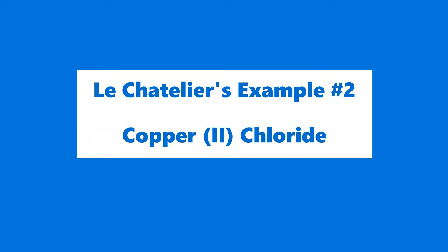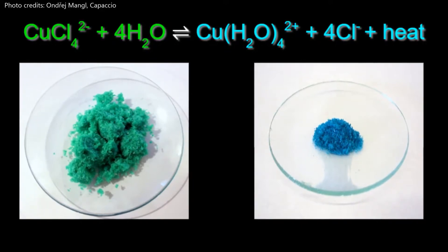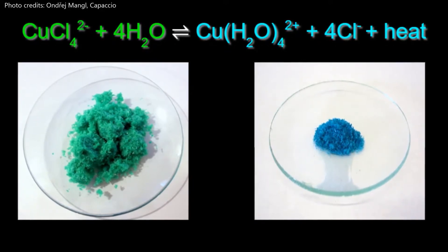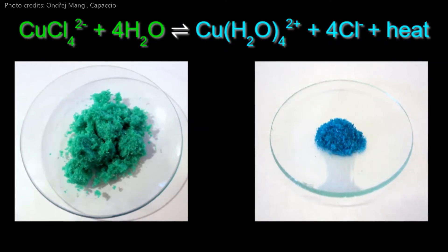The second experiment uses a solution of copper chloride. In this example, the forward reaction process produces a blue colored solution, and the reverse process produces a green colored solution.